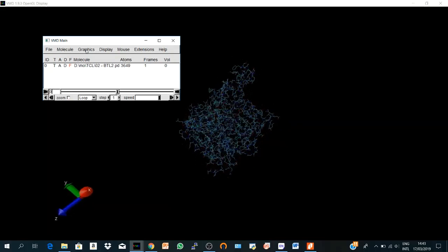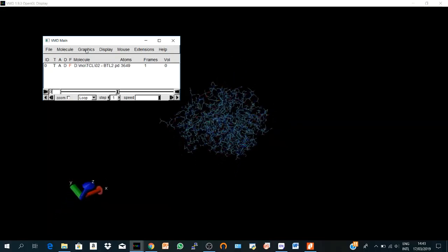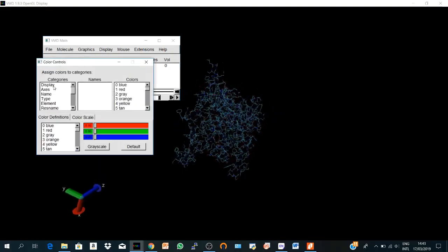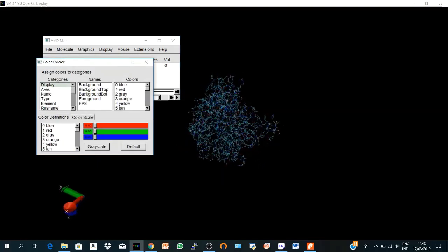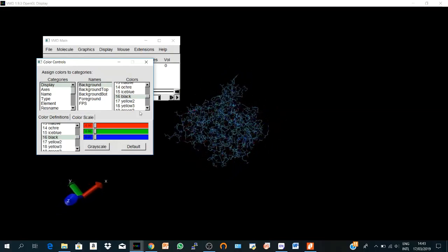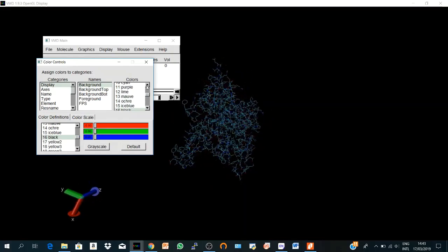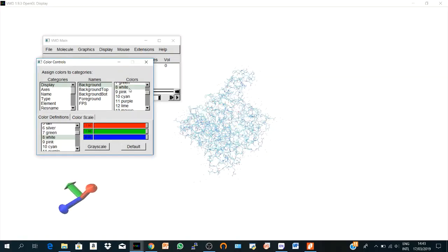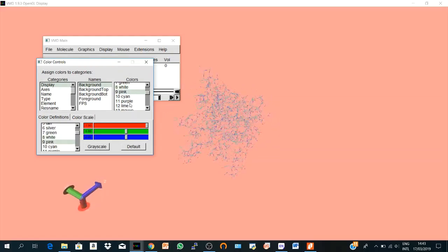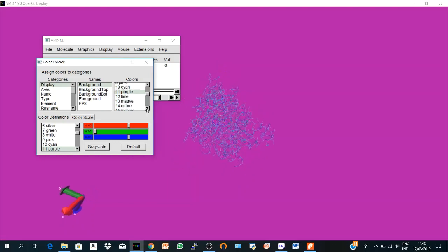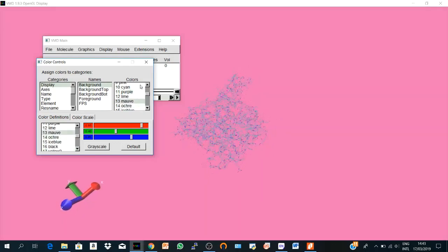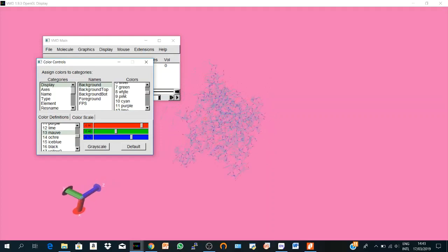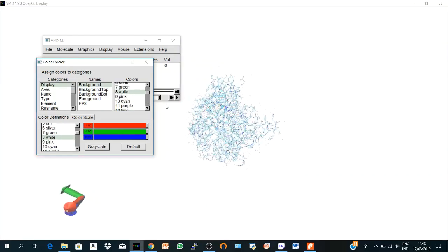So to turn the black screen or any screen color, you can go to Graphics, Colors, Display, and you choose the general background. Here you have so many colors and I prefer white, which is number eight. Here it is. Some people may like pink, some people like purple and so many colors, but I think white is the best one. So here we have a white structure.